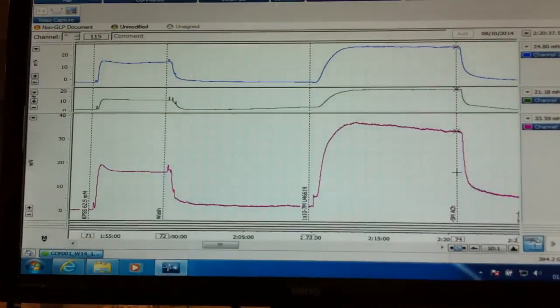If we look at the example trace on the screen here, we can see that tissues initially undergo a wake-up procedure.